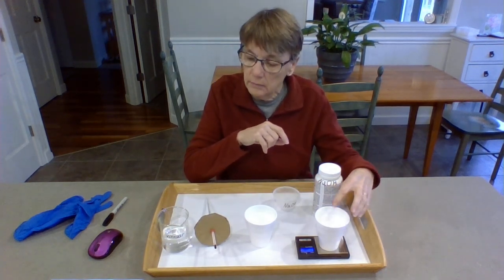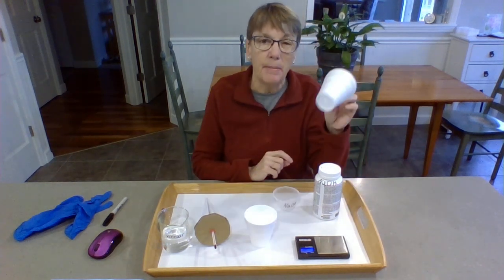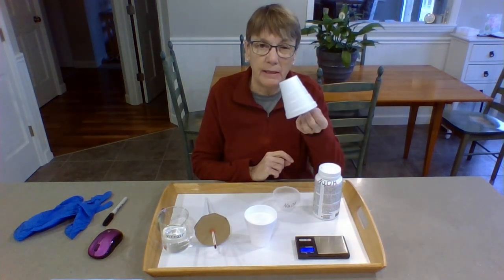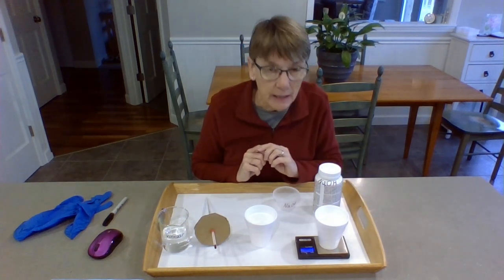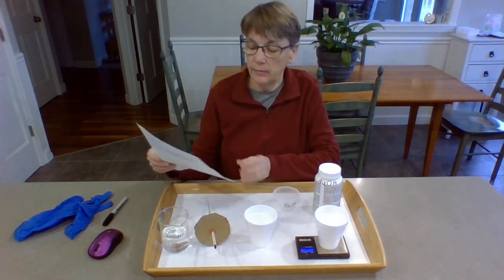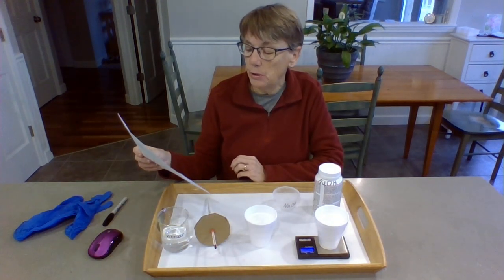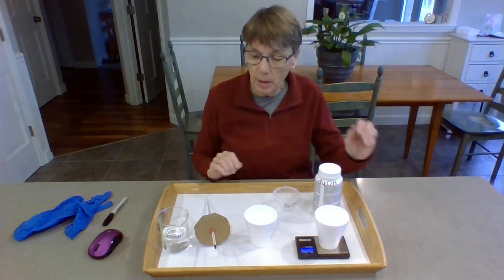Oh, actually I'm going to tare it first because what I want is to determine the mass of this, which is going to be my calorimeter. So I'm going to determine its mass, and it's 1.9 grams. So on your data sheet, in your step 2, that is the mass of the top cup.